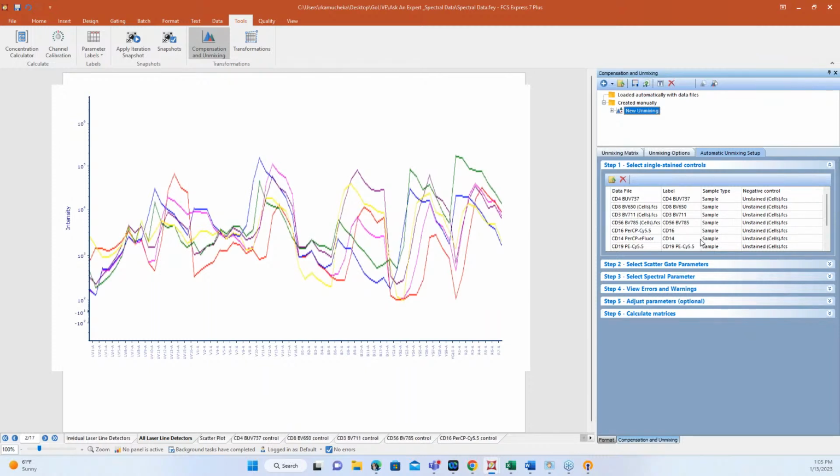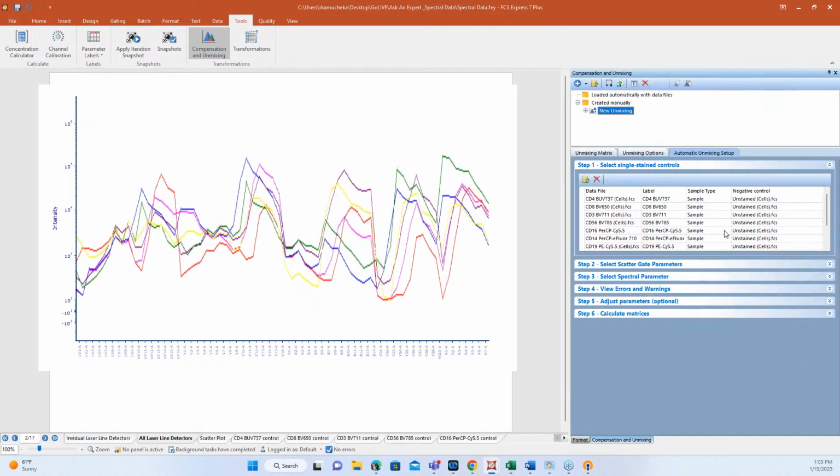Holly, with unmixing, how do you feel it is when you first try it for the first time? I think it's actually, especially, you were talking about how similar it is to compensation, in terms of the wizard part of it. I feel like our wizards are really set up very well to have those step-by-step instructions on how to do it. I feel like it can come off as intimidating at first, like, oh my gosh, how do I do this unmixing? But you really just kind of have to do what the wizard tells you to do, and it all updates in real time, right?